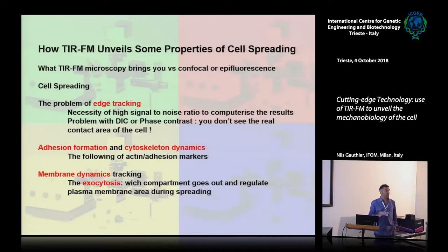What type of problem and what type of answer did we get from this microscopy? We're going to see along the lecture that we solve different problems around edge tracking, meaning knowing the properties of the leading edge of the cell, adhesion formation, cytoskeletal dynamics, and also membrane dynamics.